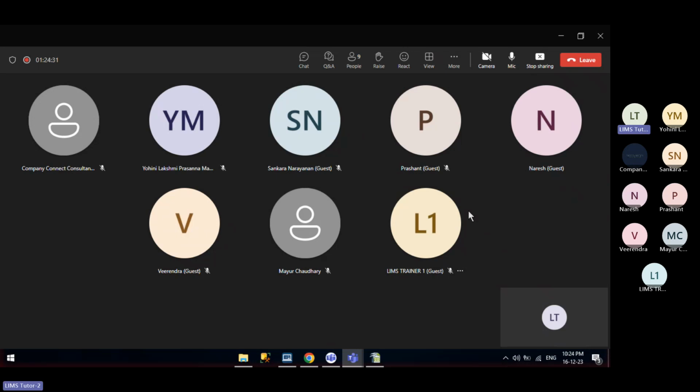So in static data, how the analysis is configured, how analysis is created, how the specification, or we call it a product specification, is same as product in lab LIMS. So how the product will be configured, how multiple analysis or tests will be mapped to the product, how different types of stages will be created in the product.